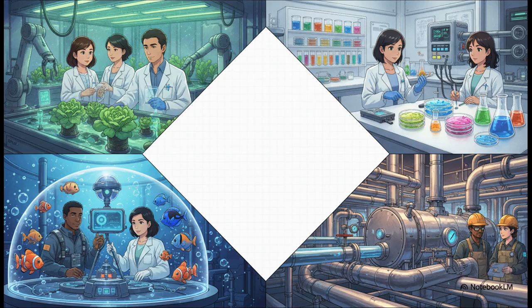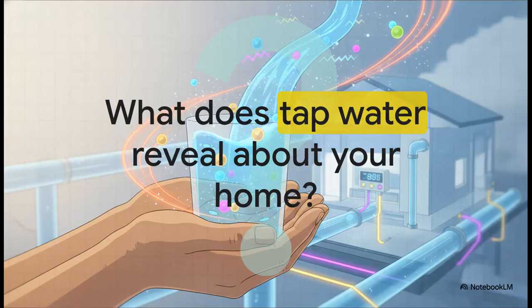detecting trace dissolved metals. As we wrap up this masterclass on conductometry, I want to leave you with this thought. Knowing what you know now about ions, temperature, and electrical potential, the next time you pour yourself a glass of tap water, just consider the invisible, bustling electrical universe hidden right there in your hands. What unseen dissolved solids and microscopic charge carriers are flowing through your home right now?